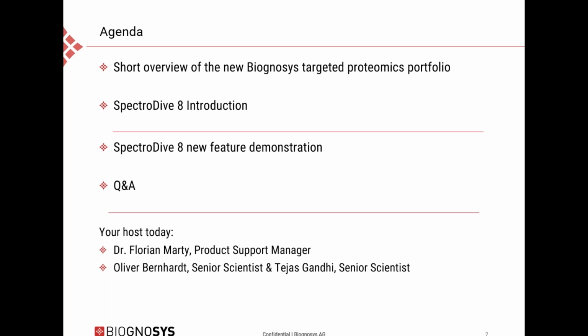First, we're going to look briefly into the new Biognosys targeted proteomics portfolio that we recently relaunched. Then I'll show you a short introduction to SpectroDive 8. We'll look at some new features of SpectroDive 8, and in the end we will host a question and answer session. For this session today, Oliver Bernhardt and Tejas Gandhi, senior scientists at Biognosys, will join me.